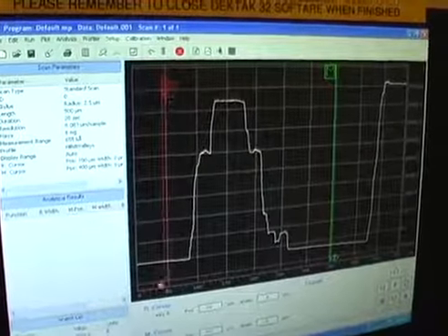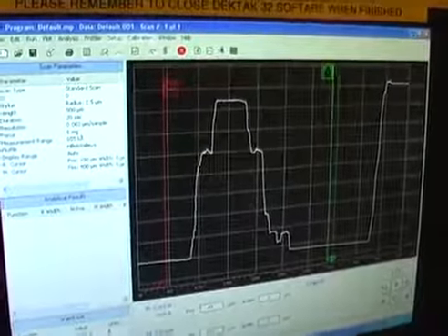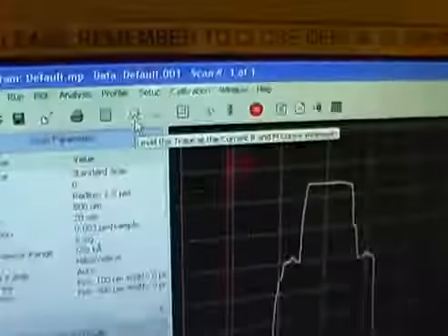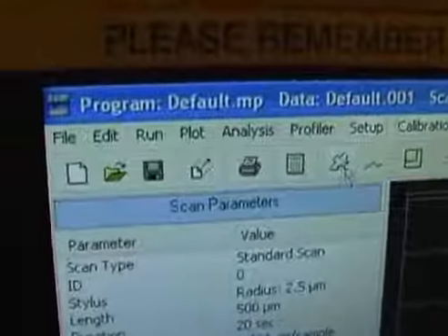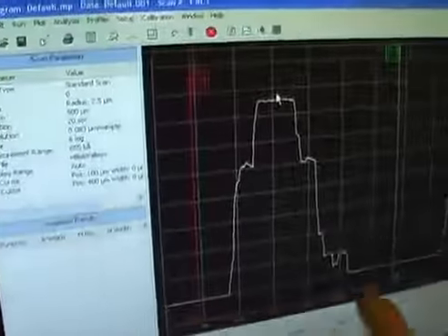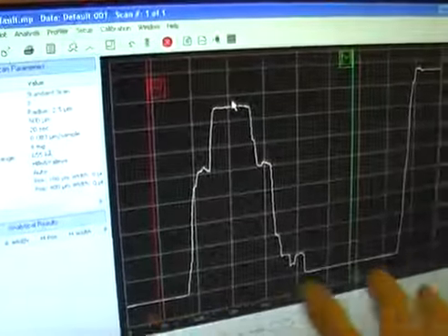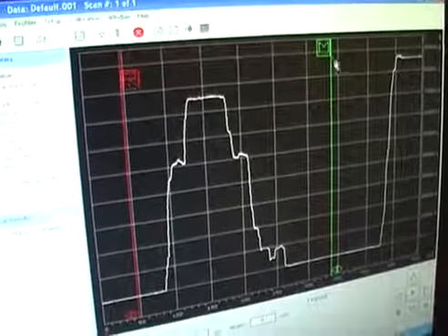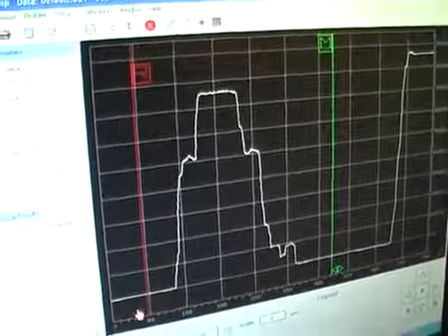So we set it here, another one here, and press the other button here. Then we will see that these two surfaces are actually at the same horizontal level. And now we can do the measurement. We set this as 0.